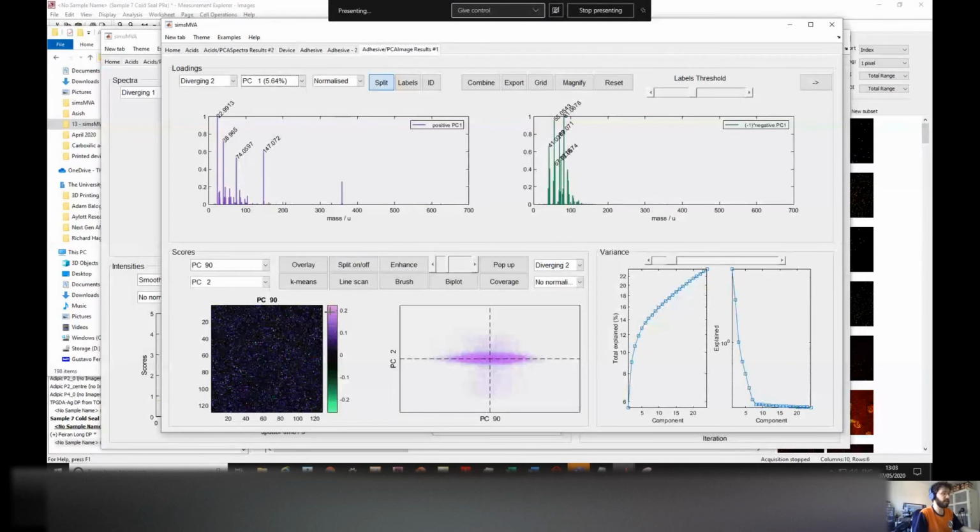Yeah, we are using simsMVA. There's no button to do that, but yes, you could do that. We could do a 3D plot with 3 principal components. It may be a good thing to add as well if people find it useful. And yes, the maximum is 3D, but it can be useful. Not right now. We have to go back to MATLAB and do it, but at the moment with simsMVA you cannot do it, but it's definitely possible. Similar to the spectra case.